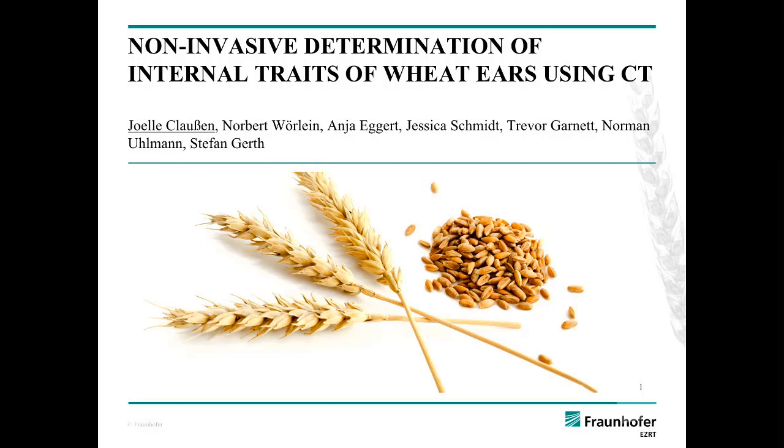First of all, I want to thank you that I can present some of our work here. I'm talking about a non-invasive determination of internal traits of wheat ears using computer tomography.